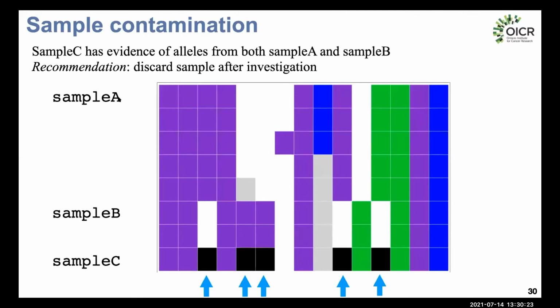So we have a bioinformatics script that will do this sort of analysis. It's called mixturecheck.py, which will analyze a consensus genome, the coverage profile, and allele frequencies to determine whether the pattern of variation can be explained by having mixed 2 samples together. This can be simple pipetting errors, like just pipetting 2 samples into the same well, or other things like splash over between adjacent wells on your PCR plates. So typically when you find this mixture pattern, the sample will be flagged and you would discard that one, not proceed with downstream analysis, and not release it publicly.